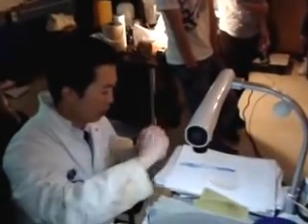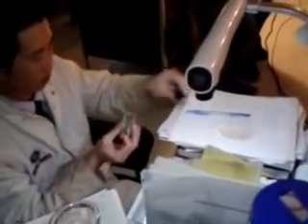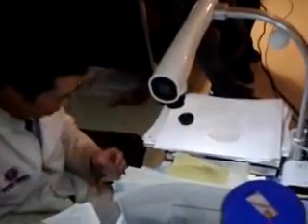Now what we have here is copper pennies. It works best with an American penny. And I'll just take this one here. And imagine that this copper penny represents your copper fences, copper buildings, copper whatever materials around in your city. And I'm just going to put it right here on this watch glass. And I'm going to put that in here.